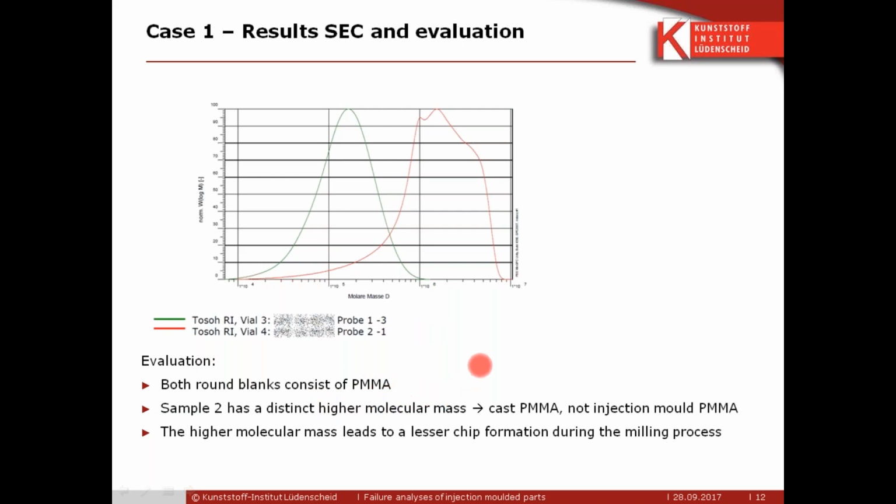In case of PMMA, you can really calibrate. You find many standards of PMMA, but sometimes you also use a PMMA standard for a measurement of, let's say, PBT. So in this case, you only get relative molecular masses, but for PMMA, you often get the absolute masses.